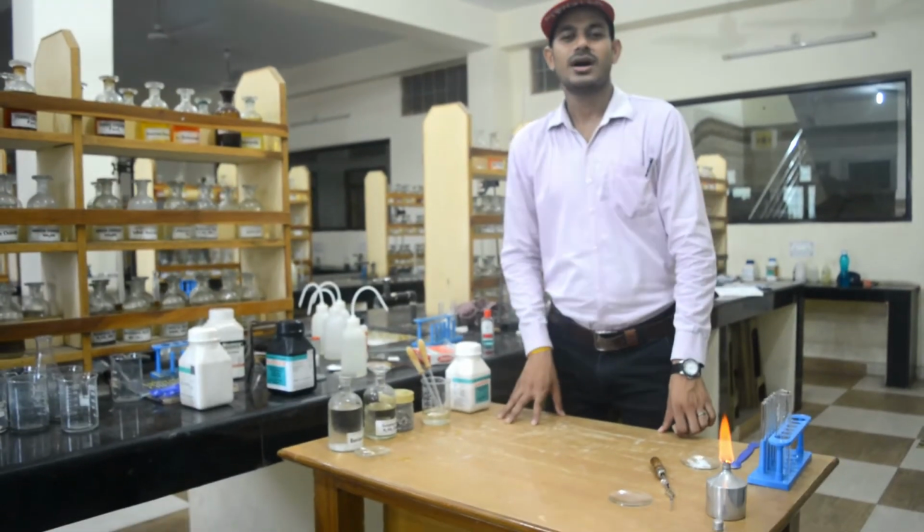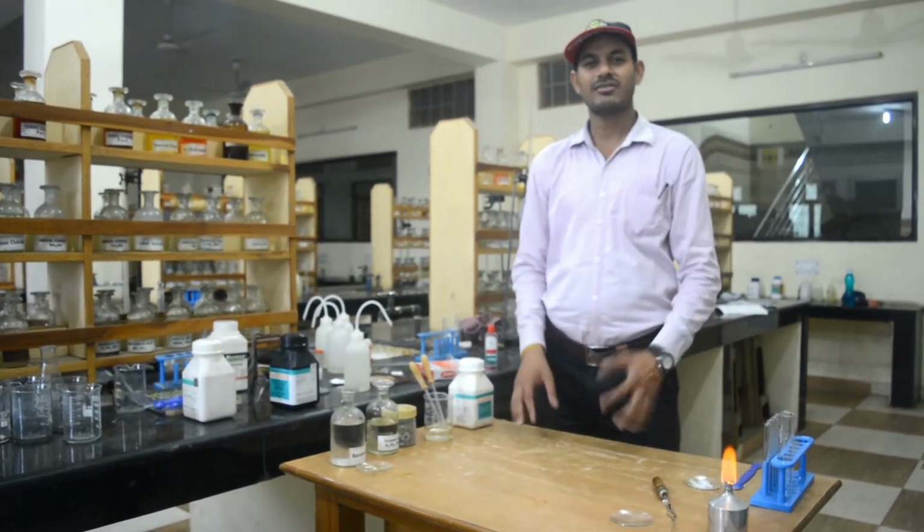Hello students. Today we will perform the different types of chemical reaction practicals.